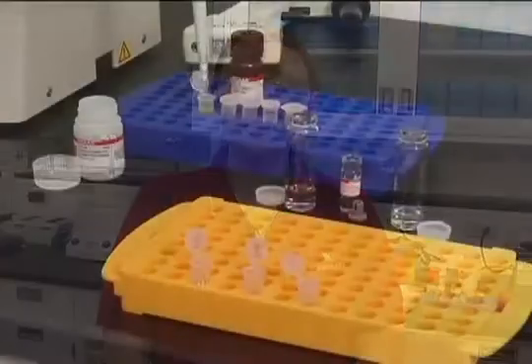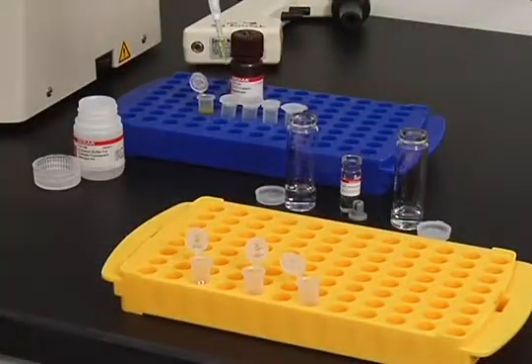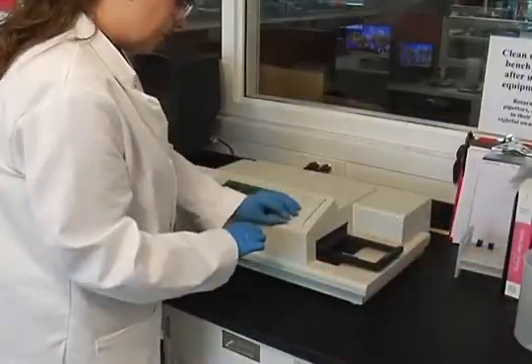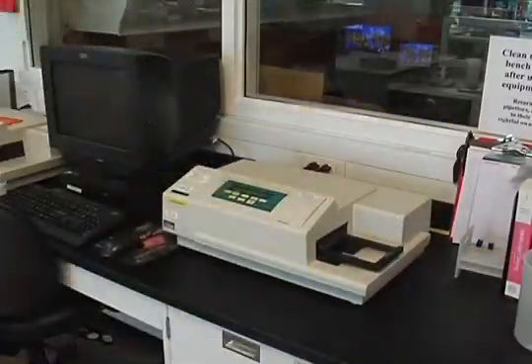Hi, I'm Carrie Cup-Inyard, and I'm a scientist at our Sigma Aldrich DeKalb facility in St. Louis, Missouri. Today I will be showing you a procedure for fluorometric protease activity determination. We use this procedure in our quality control lab to determine low protease activity. So let's get started.